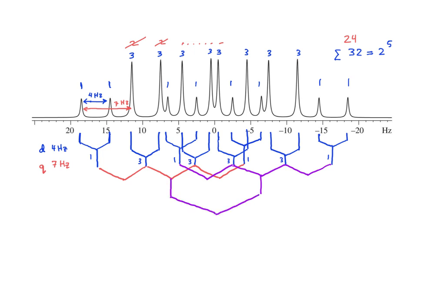To find that difference, I recommend working back along the path of each of the 2 quartet components. For the other quartet, also work in the same direction, in this case, toward the left. And that reveals that the last coupling is a doublet separated by 12 hertz.